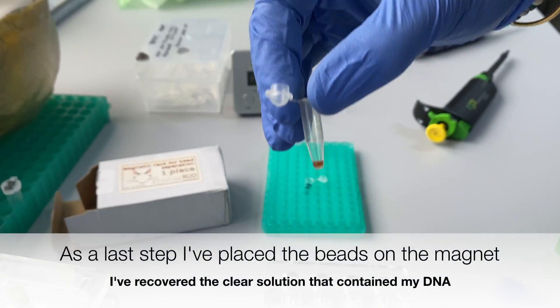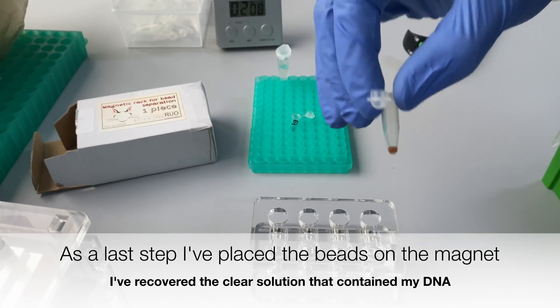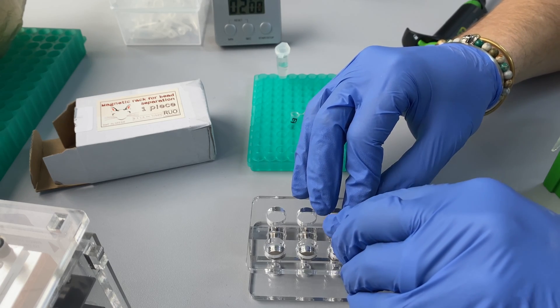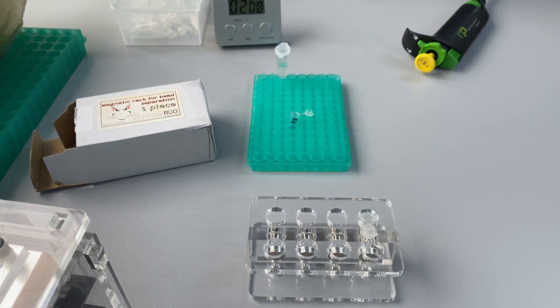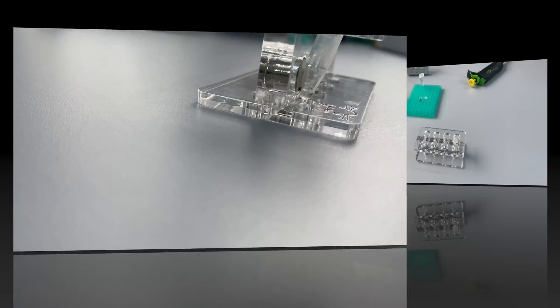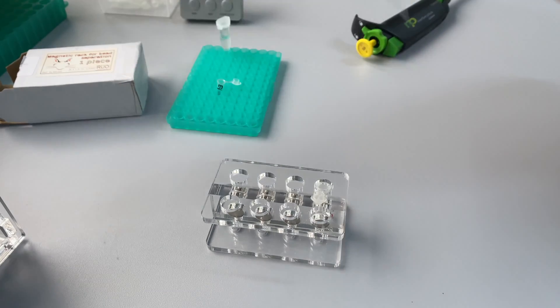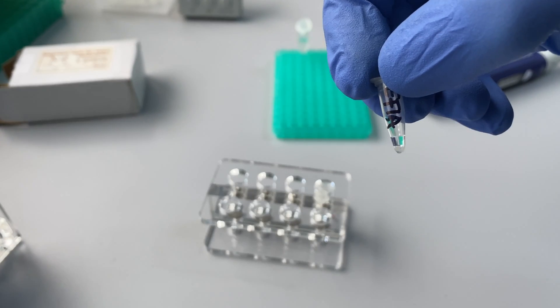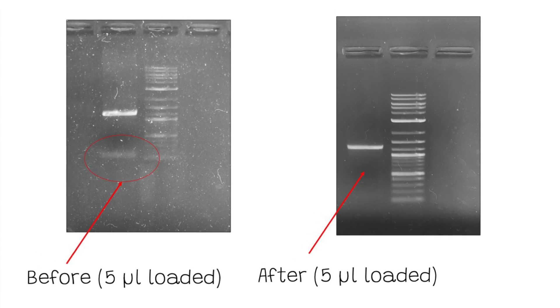As a last step, I placed the magnetic beads on the rack again. After the solution clears and the beads remain stuck to the wall of the tube, all of my clean PCR products remain in the clear solution, so I can easily extract the DNA by pipetting out the solution. After doing all of this, I put the PCR product on a gel — and as you can see, I have managed to get rid of the unwanted PCR product.